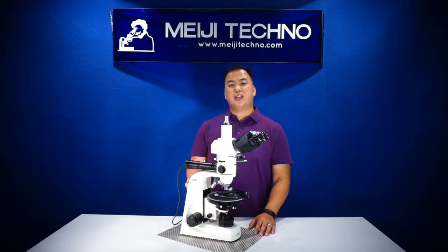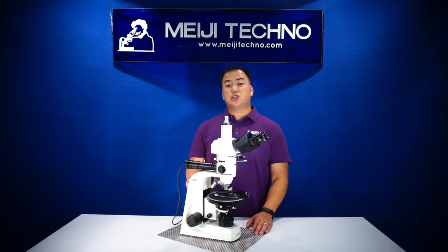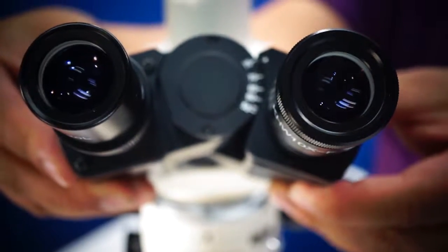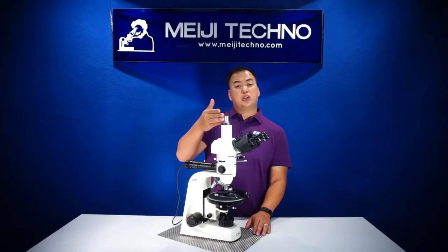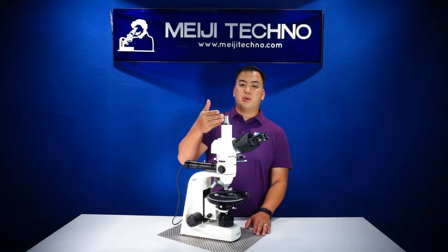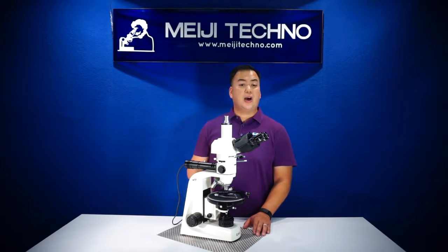80% of the light travels through the trinocular tube and 20% of the light travels through the eyepiece. All heads have an interpupillary distance of 53 to 75 millimeters. The trinocular tube can fit most SLR cameras or CCD or C-mount cameras available on the market.